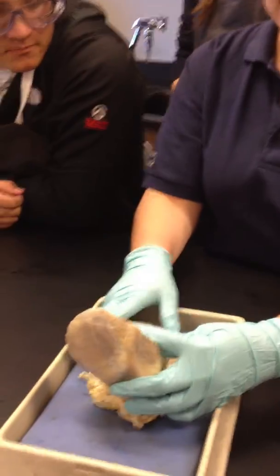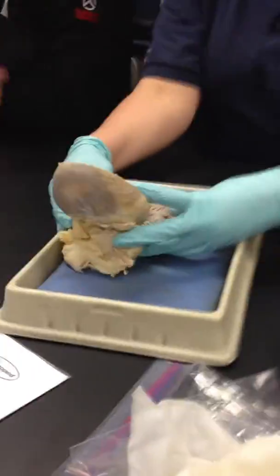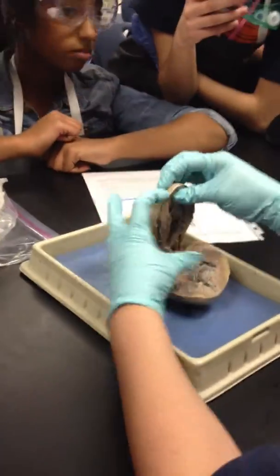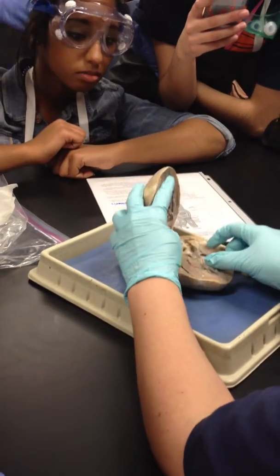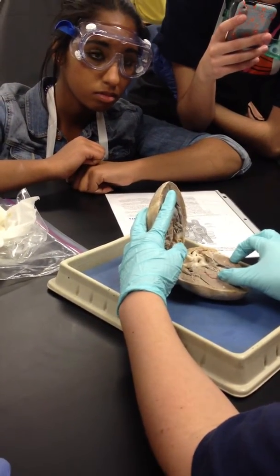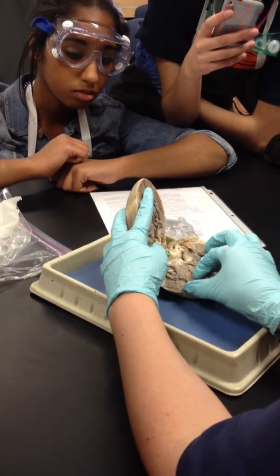Right side and left side, even if I flip this around, how do I know which is right and which is left? The left side is going to be my meaty side, right? Okay, this is going to be my left. If I flip it around, this is going to be my left side. You know it's left because of the actual size of the ventricle down here. It is so much bigger than the ventricle that's sitting over here.